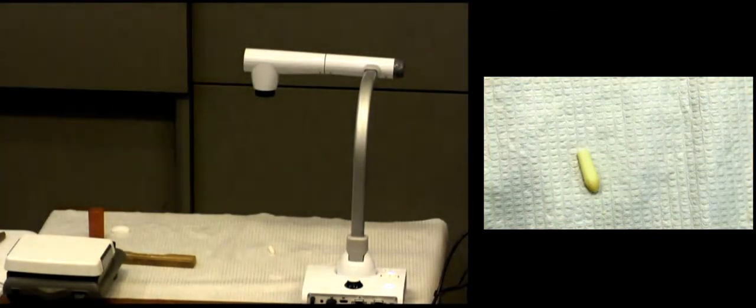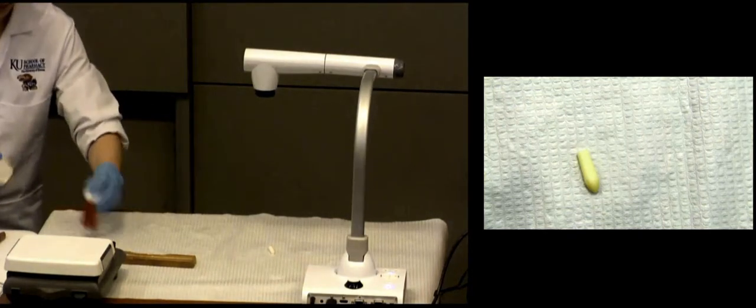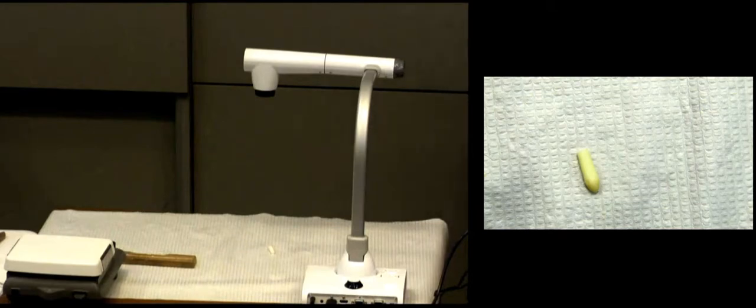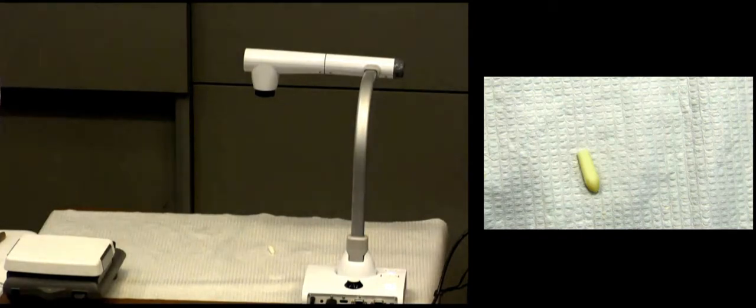There's two possible things for dispensed suppositories. You can wrap them individually in foil, because certainly you don't want them to rub and lose their drug. They can stick to each other. They can stick to other things. So you can wrap them individually with foil, or what a lot of pharmacies now use, what they call cardboard suppository boxes. And those have dividers, and those dividers are wax lined so that the suppositories don't stick. So we can assume for this, we would be dispensing that into a divided suppository box. That's kind of what we would say to do that.